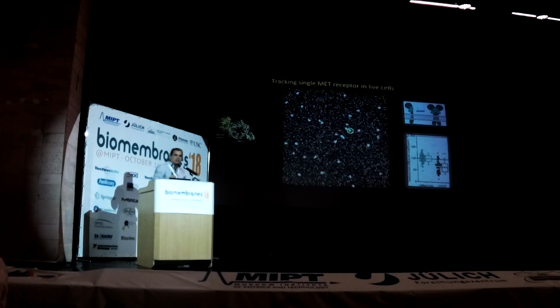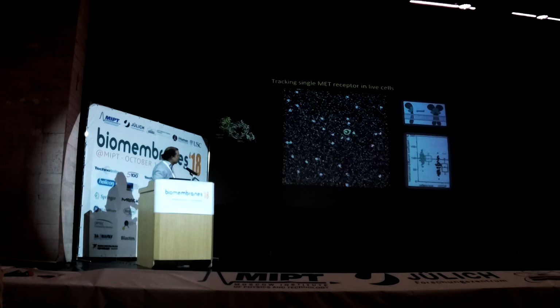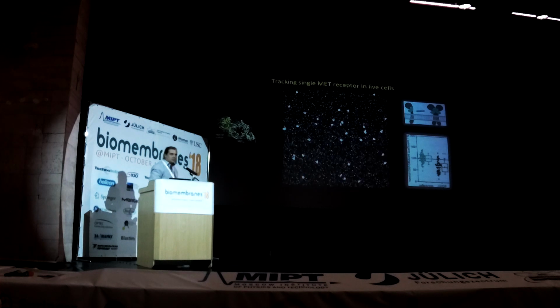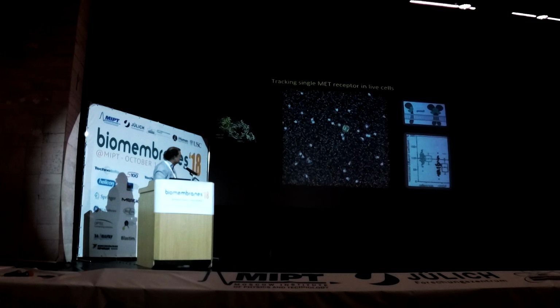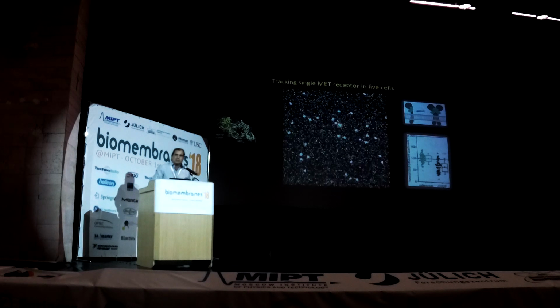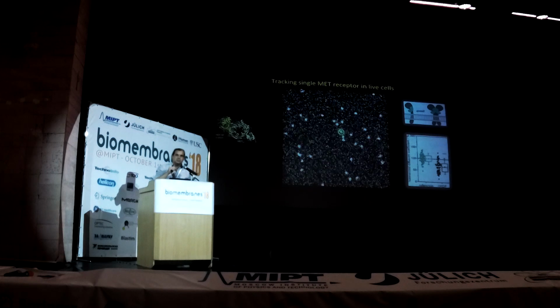And you can appreciate that this single receptor all sorts of looks for different partners. Some of those receptors meet multiple times, others stay together for a longer time. Let me restart this movie. And we can nicely follow that and extract the kinetics. This is the resting receptor.